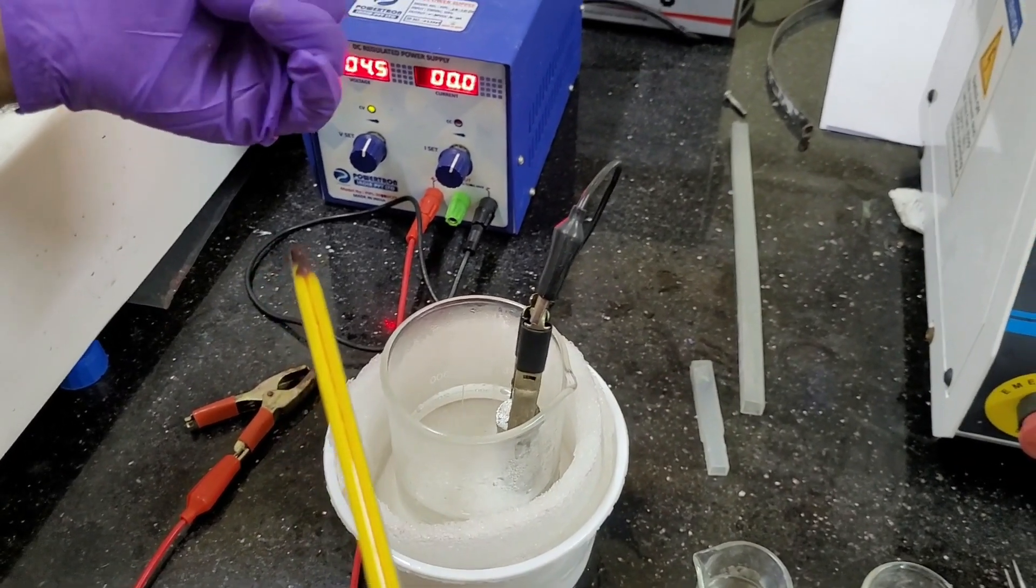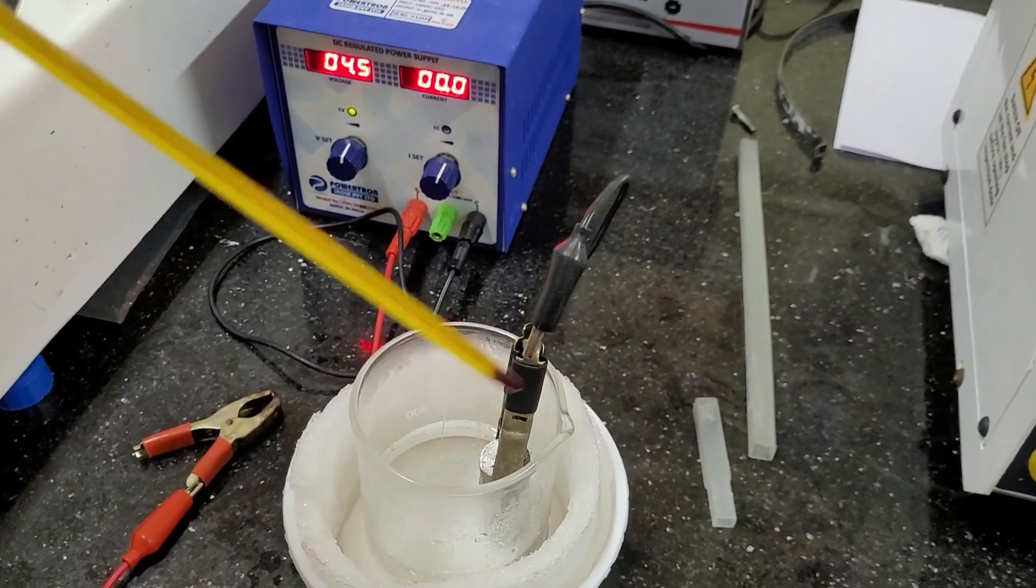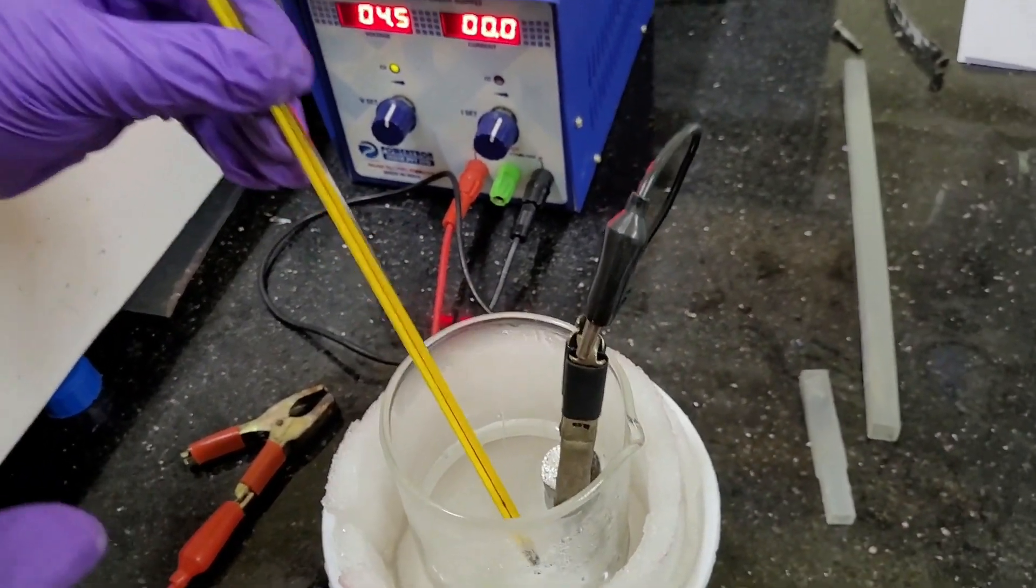Temperature is like minus 30 degrees centigrade or minus 20 degrees centigrade. So, this specific kind of thermometer we need to use. And in this way, we can measure the temperature.